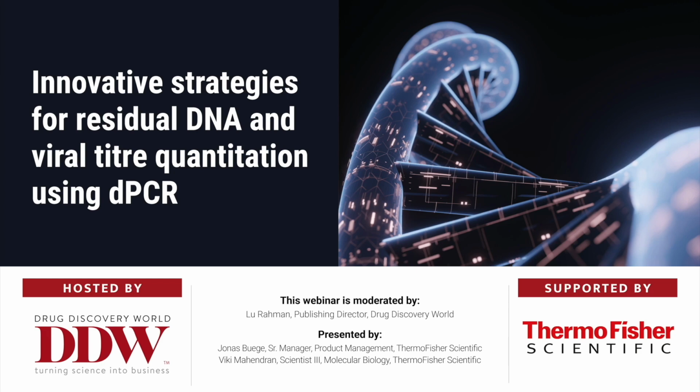Leveraging digital PCR-based assays for the quantitation of residual host cell DNA or viral titers within a biotherapeutic manufacturing workflow offers value in ensuring product quality and safety. Digital PCR, or dPCR, is a highly sensitive and precise technique that enables the absolute quantification of nucleic acid targets. In the context of biotherapeutic manufacturing, dPCR provides a robust method for measuring residual host cell DNA or viral titers, which are critical parameters to assess the purity and potency of biopharmaceutical products.